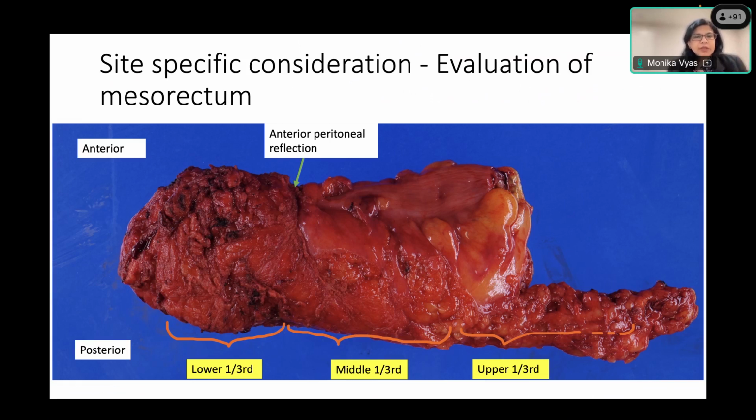This is very important while grossing these rectal specimens for two reasons. One is that we have to evaluate the mesorectum, which I'll come to, and the other is assigning a location and staging the tumor. As you'll see, tumors in the upper rectum, when they involve the serosa, become pT4a. If the tumor is in the posterior rectum, then it's not related to the serosa, and if it involves the circumferential resection margin, then it's a margin positive status, but still T3.